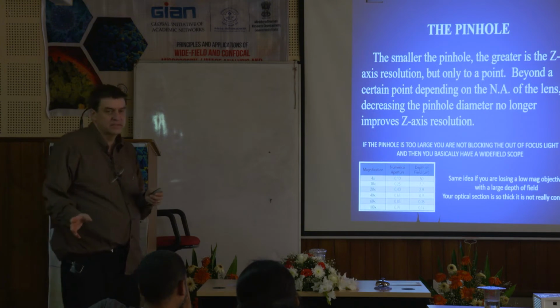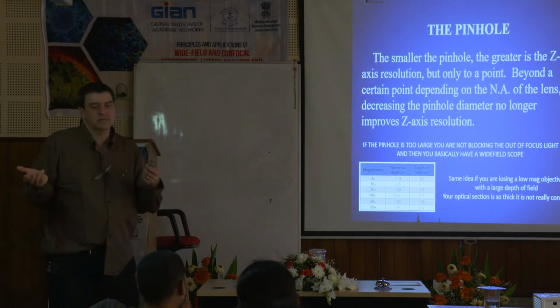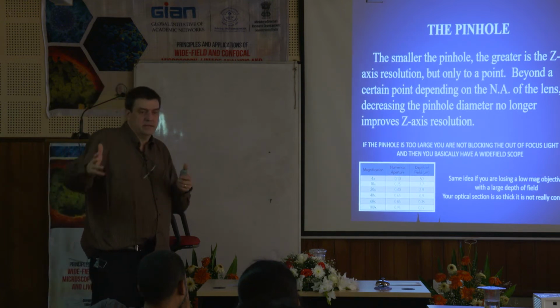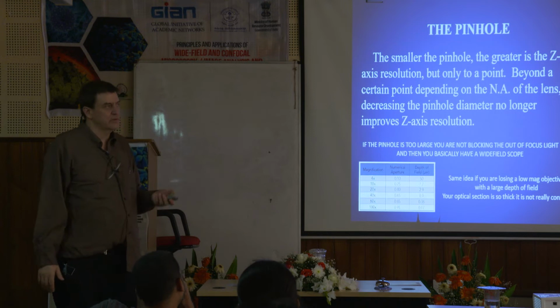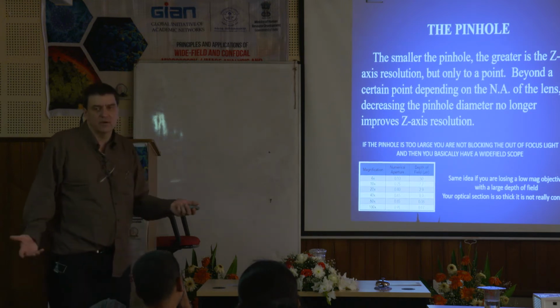Okay. Does that make sense? I mean, it's a concept. Like I said, it doesn't come into play that much because these modern microscopes take care of this for you. But I think it's important you understand the idea. Because I get people come to me like, we want to do confocal like 5x or something. It's like, well, why bother? I mean, you're not accomplishing anything.